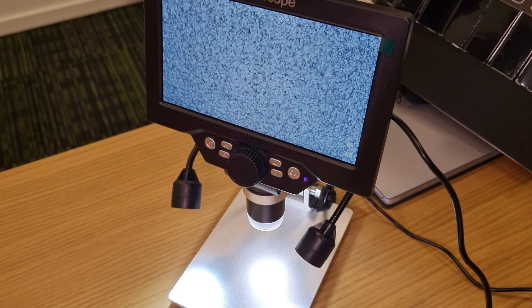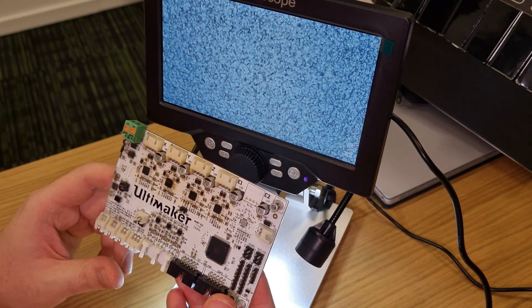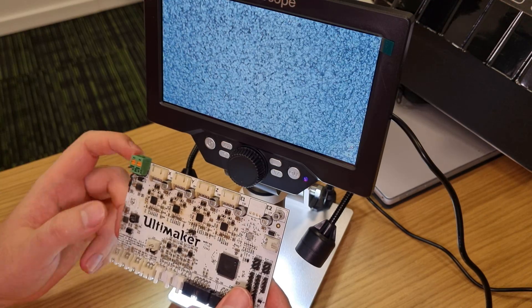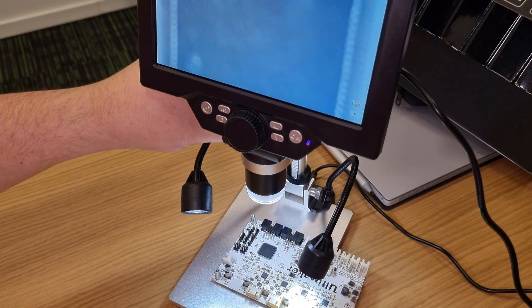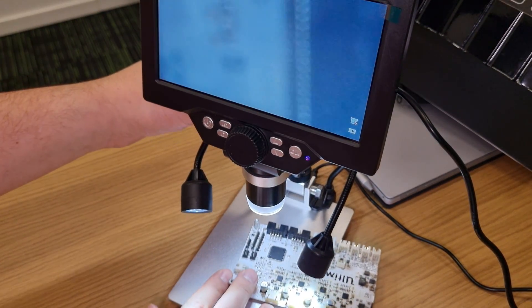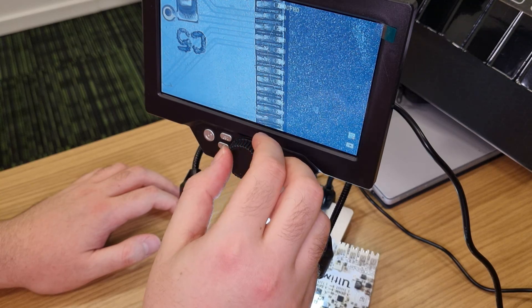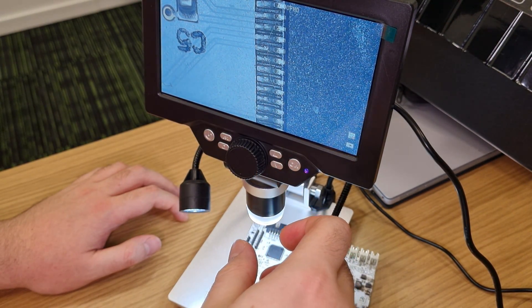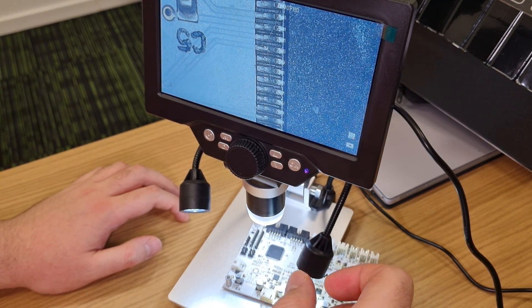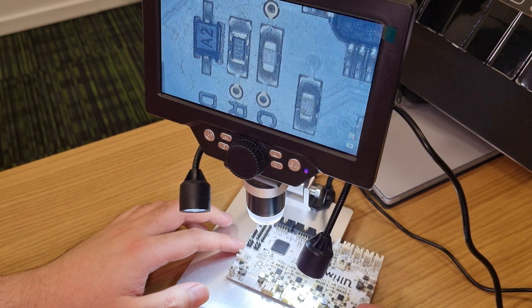Let's check how it works as a microscope. We'll take a look at the remains of an Ultimaker board. Taking a closer look — okay, there's something like a piece of hair or something. Let's move somewhere else — yeah, it's dirty.